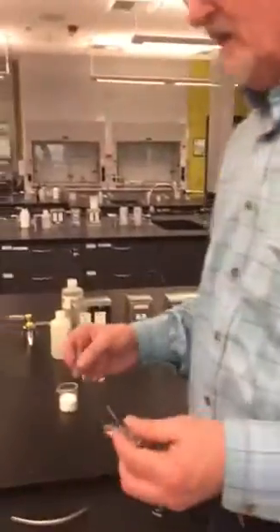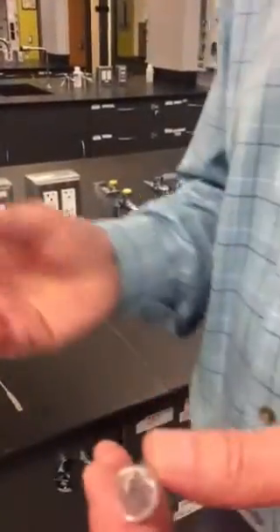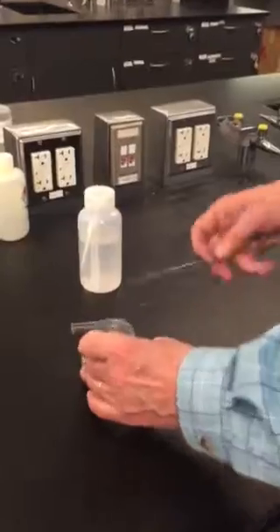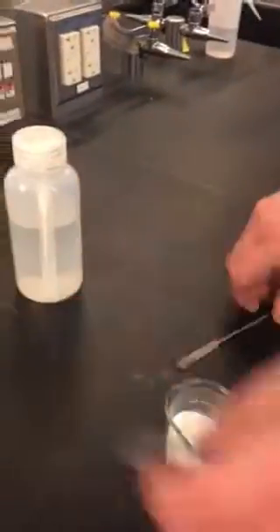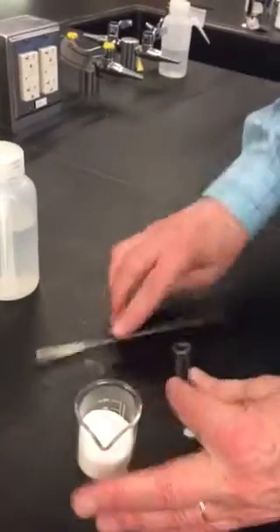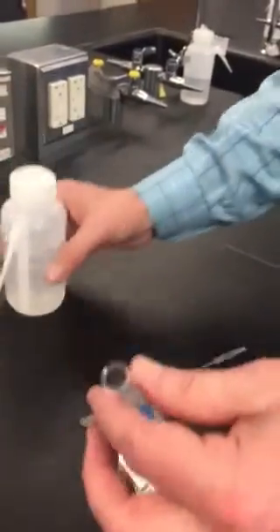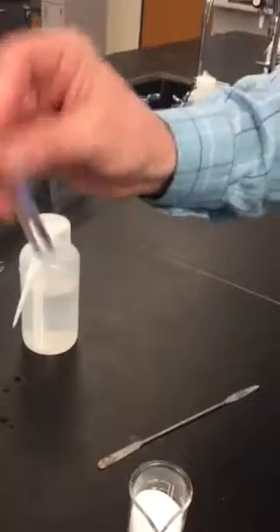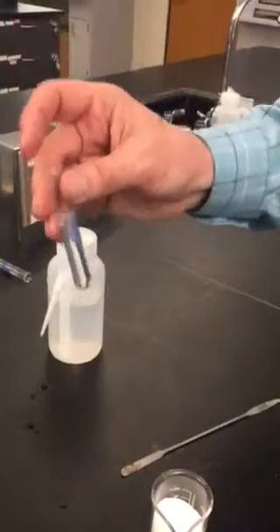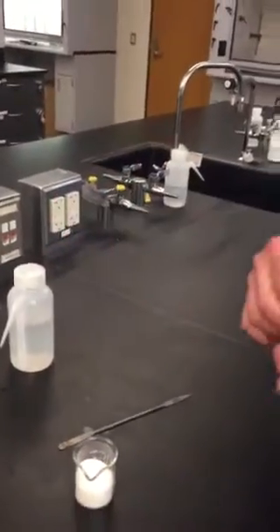Experiments 3, 4, and 5 are very simple. They're going to involve these tiny test tubes. In experiment 3 you'll be looking at the solubility of different substances — this happens to be sucrose or sugar — and you're just going to put a very little bit into the test tube. Then you're going to add deionized water from your wash bottle, agitate by shaking up and down and side to side, and give it a few minutes to see whether or not the sugar dissolves and disappears. Note your results. You'll do the same test using water and iodine crystals.